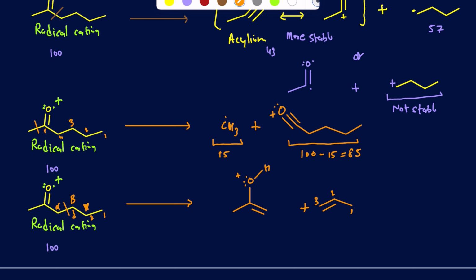So basically what happens is you break this bond right there, and when you break this bond, one of the electrons goes on here to make the pi bond, and the second electron to make the pi bond is going to be from this pi bond right there, and then one of these electrons right there is going to go on to the hydrogen of the gamma. I'm not really showing the mechanism, but just see where the fragmentation is going to take place.